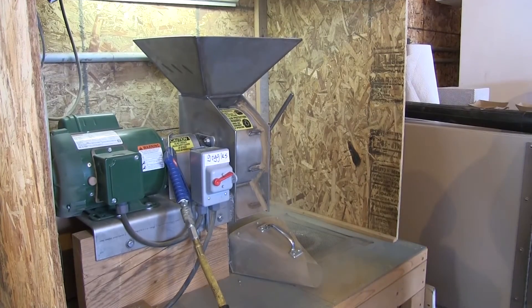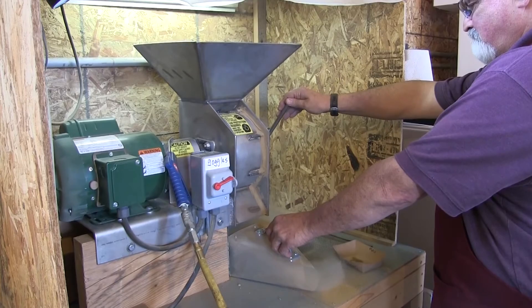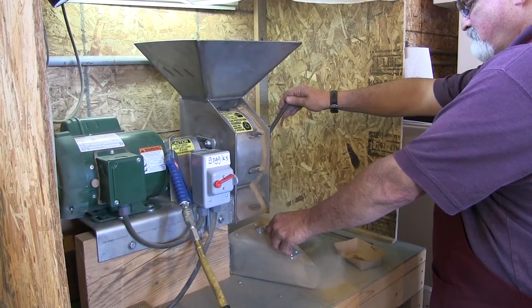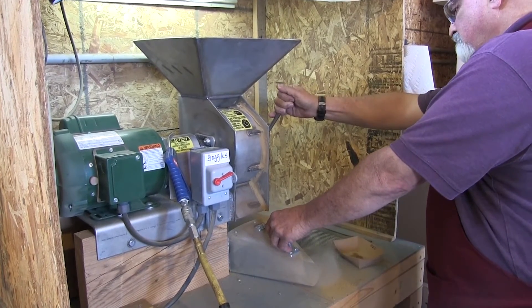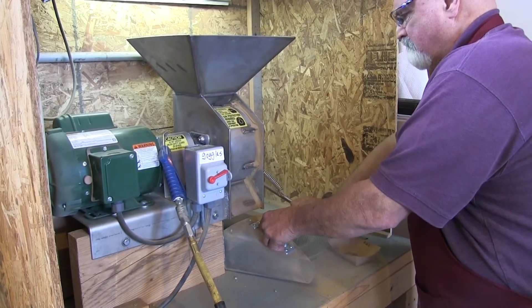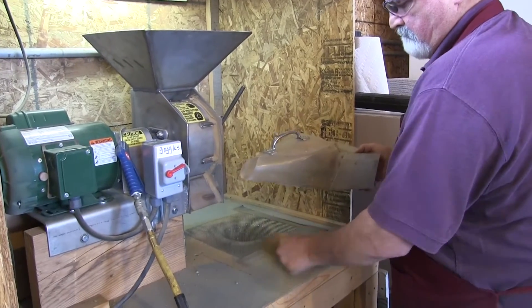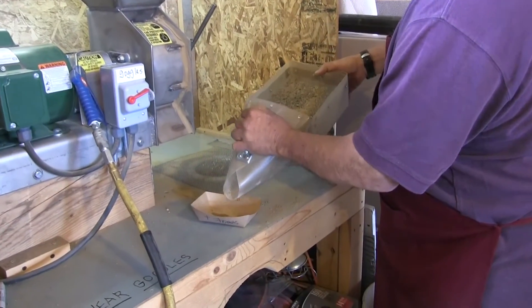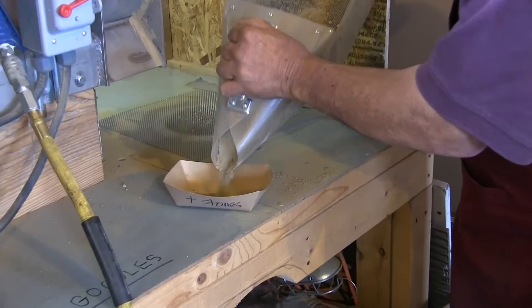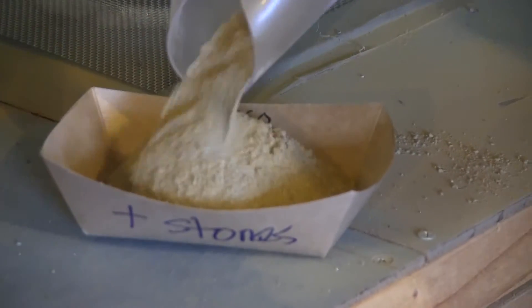This is a popular soil grinder used to prepare high volume samples. It consists of a high speed rotary flail. Unfortunately, it is so forceful that all structure present is lost. In this particular case, the soil with the gravel has been ground up completely. Pulverizing soil in this way will influence biology test results very significantly.